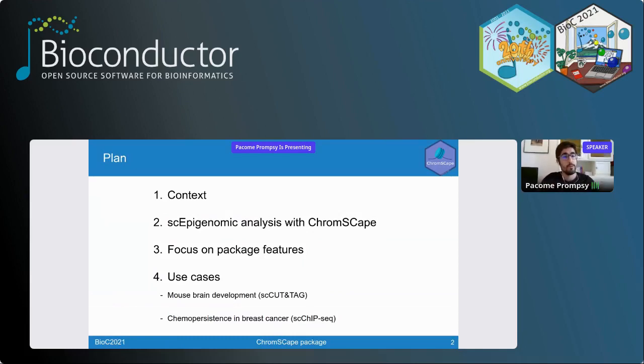I will give you a bit of context about single-cell epigenomics. Then I will try to show you a bit of the challenges and how we can analyze such datasets with ChromSCape. And I will present a short video. Finally, I will focus on some of the features that I won't be mentioning in the first two parts, and end with two use cases in which we use this application to analyze single-cell epigenomic datasets.